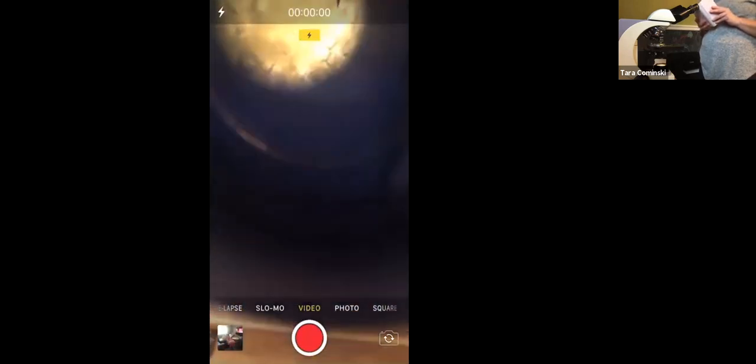Ah, darn it. What happened here? I lost my, anyway. So you can kind of see little squares in there, sort of, okay? So those are the onion cells. Like I said, you weren't gonna be able to see that much. Let me just switch it now to the cheek cells, and let's see if we can see those as well. But again, I wanted you guys to see how to make that wet mount.